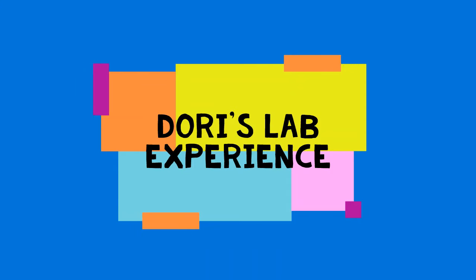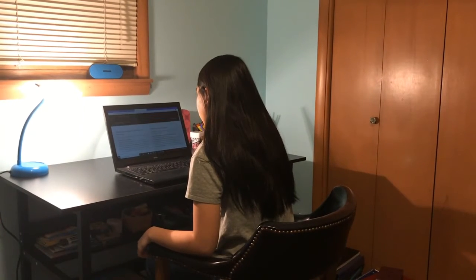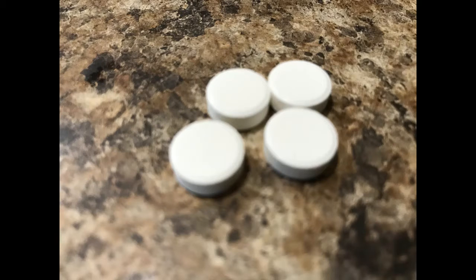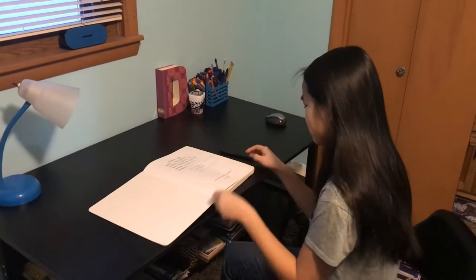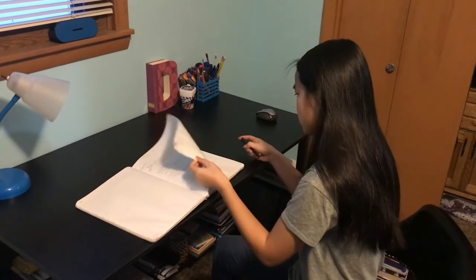My lab experience. I began working for this class over the summer by doing online research. After conducting a bit of research on the various projects, mine ended up being the synthesis and antibacterial activity of aspirin acylureas. After the initial period of general preparation, I had to choose the lab notebook and begin writing the pre-lab. It took many mistakes and scraps of paper to complete, but the final product is worth it.